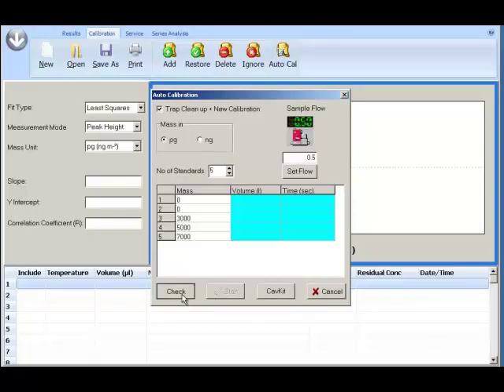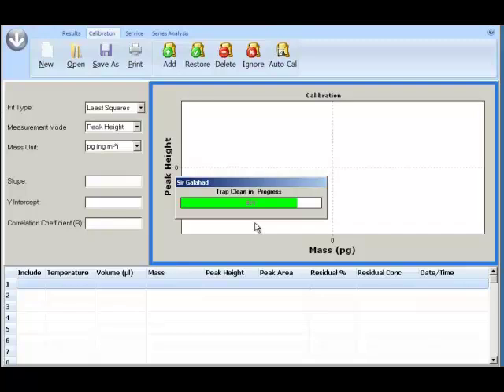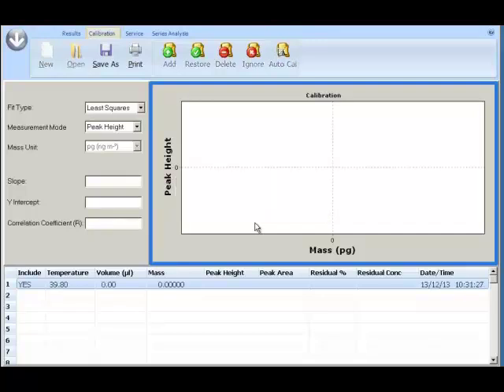Click on Start to start the Auto Calibration. The calibration will be automatically performed. First it starts the Trap Clean, then it starts the calibration. In this example it runs zero point twice.